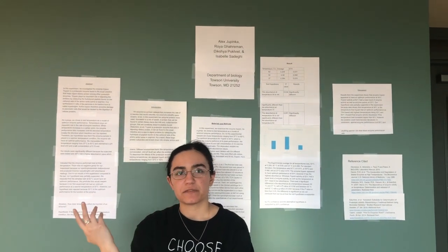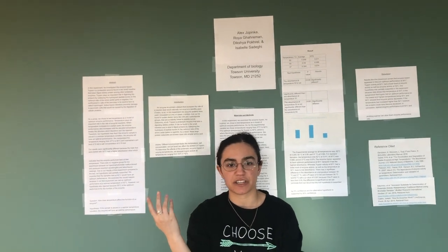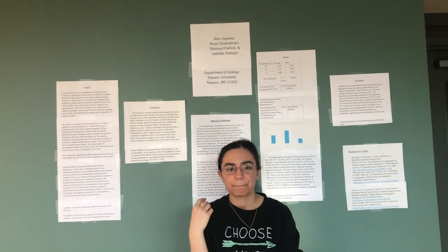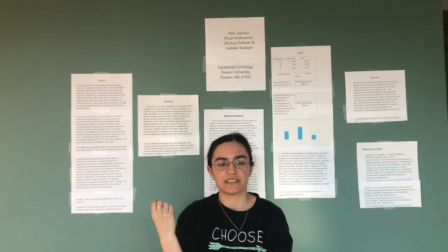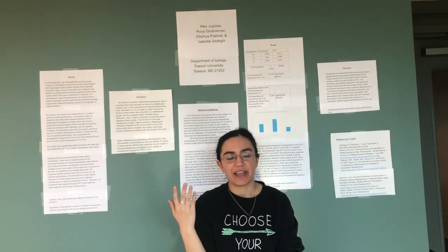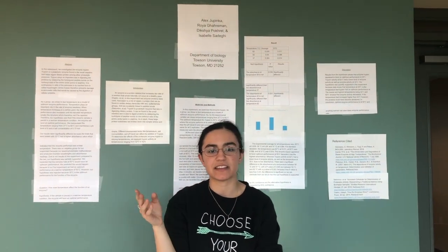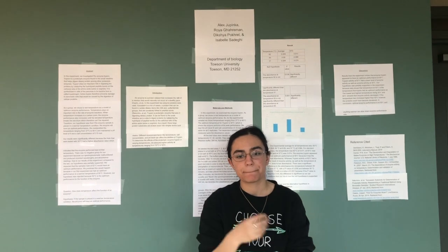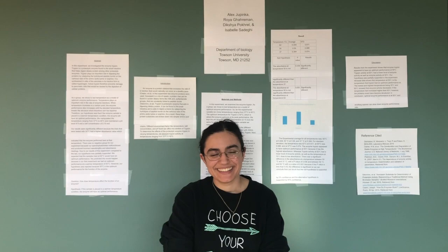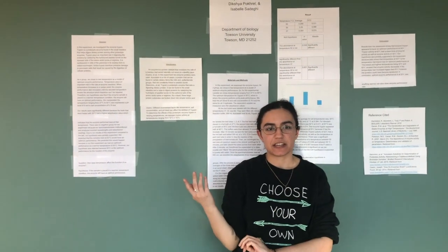The reason why we added TCA to our experiment was in order to stop the reaction and the precipitation of the macromolecule. And then we had to centrifuge the TCA because we had to be able to separate the larger particles from the rest of the solution, and the pellet basically consisted of the enzyme and the substrate. Azocasein was used for our substrate, and sulfanilamide correlates to the activity of trypsin.